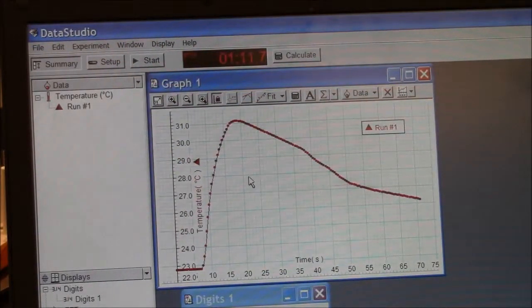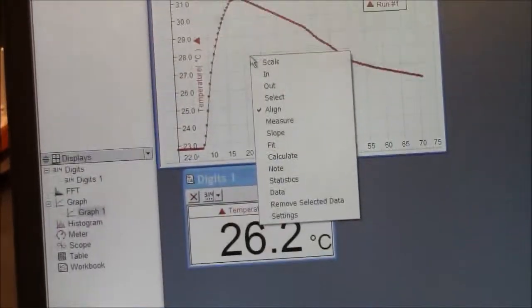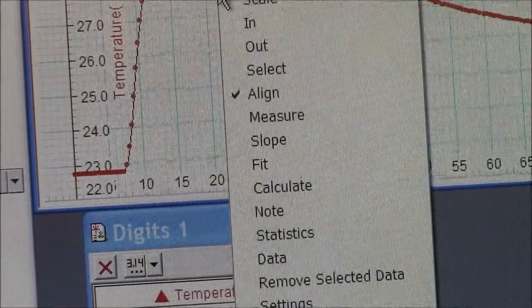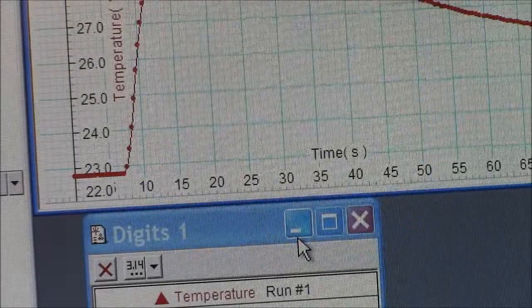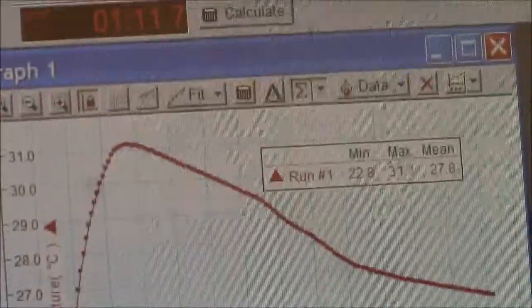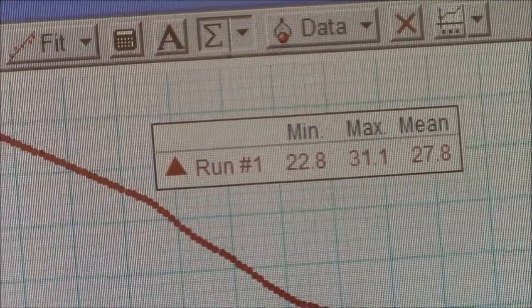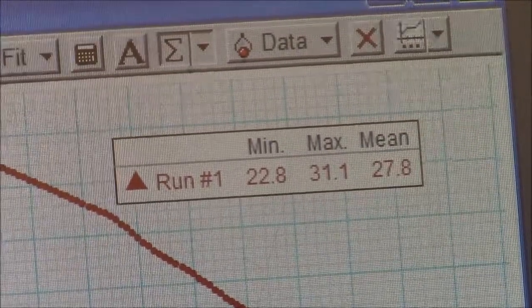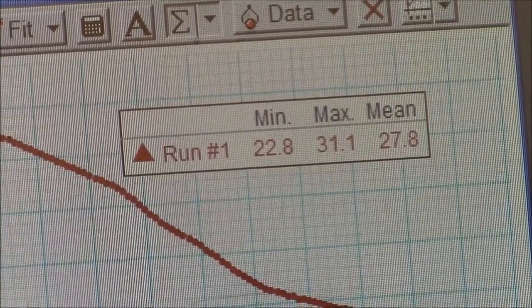The other technique you'll want to use is to put your cursor on the graph and right click. You get some choices here. The one you want is called statistics. So when I click on statistics, now on my graph appears a little window that tells me the minimum temperature, the maximum temperature, and the average temperature for the time period in question. The one you're interested in today is that minimum temperature, because you're trying to make that go to less than 0 degrees Celsius.